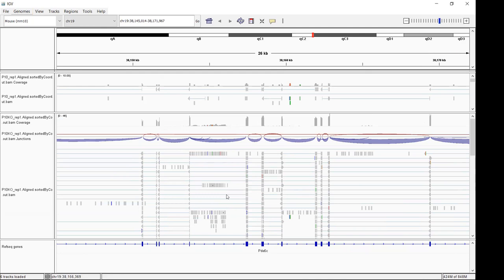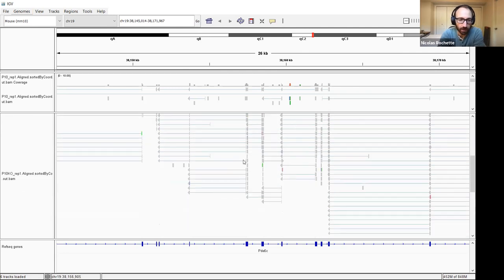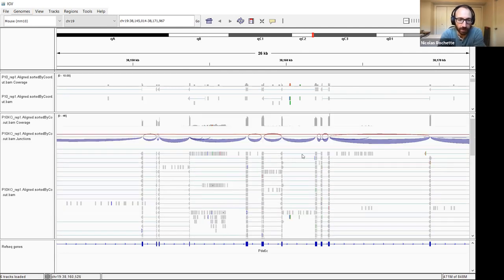This is more, I guess, a biological question, but all this stuff that maybe looks like intronic areas, do you usually just interpret that as contamination from genomic DNA, or is it more like splicing? It's not always clear. I don't think it's very clear what this is. Sometimes you do see reads mapping in there. It could be spurious transcription.